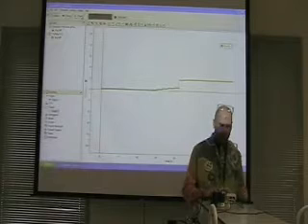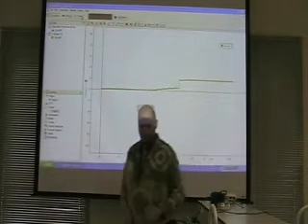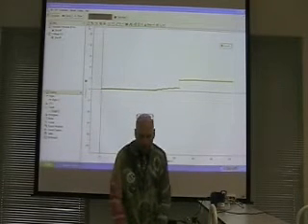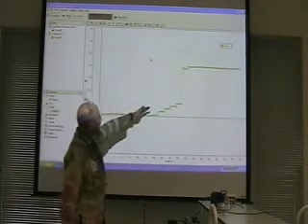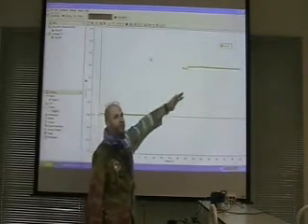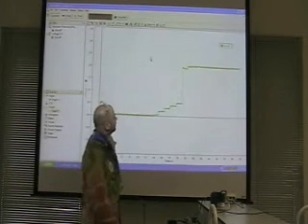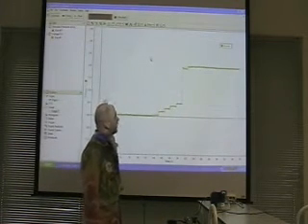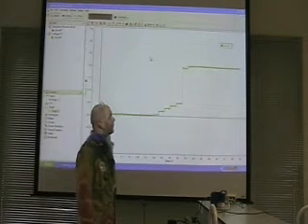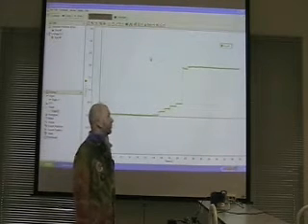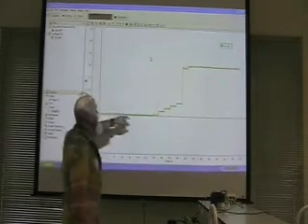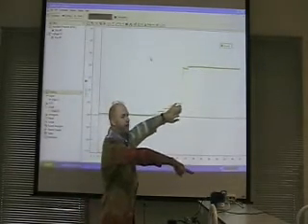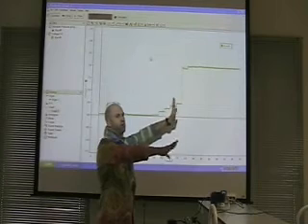Okay, and then press T and stop the thing. Alright, I don't know, fit. And you have this kind of stair step idea here. Don't know exactly why. I mean it could be any number of things and I didn't take any precautions to really mix things for instance.